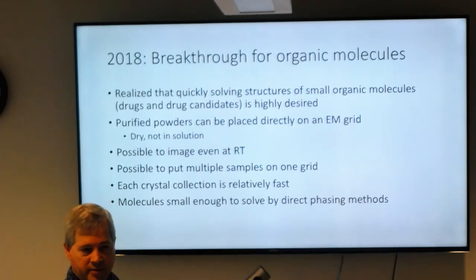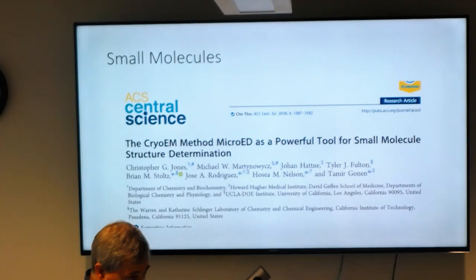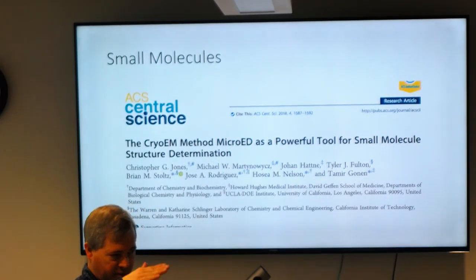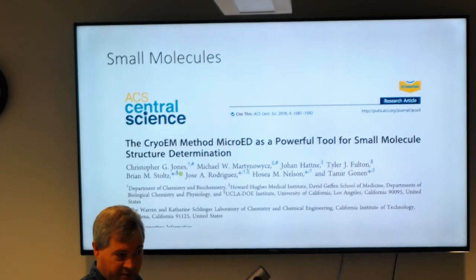Even in the vacuum? Even in the vacuum, yeah. There's no vibrational motion of the crystals? No, they seem to be stuck. When they're so small, they're stuck very tightly to the grid, basically by van der Waals forces. When things are really small, gravity and other things don't have such a large effect, but these forces become very large relative to the other forces on them.